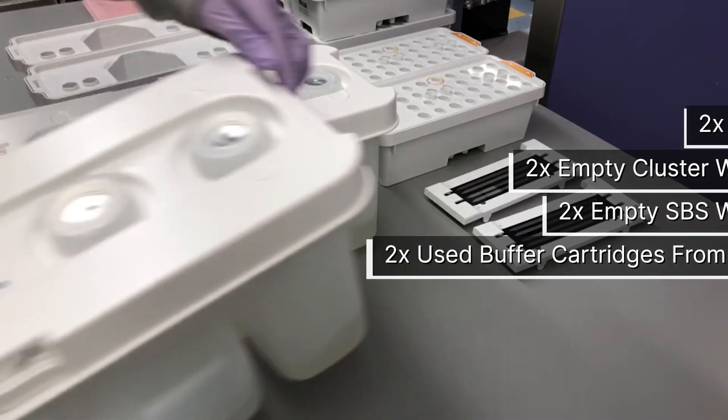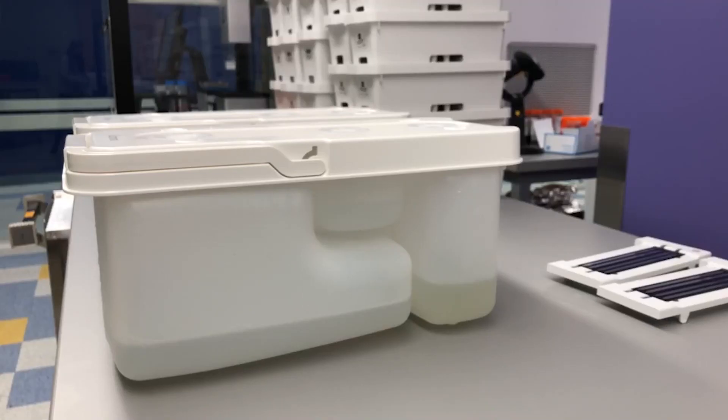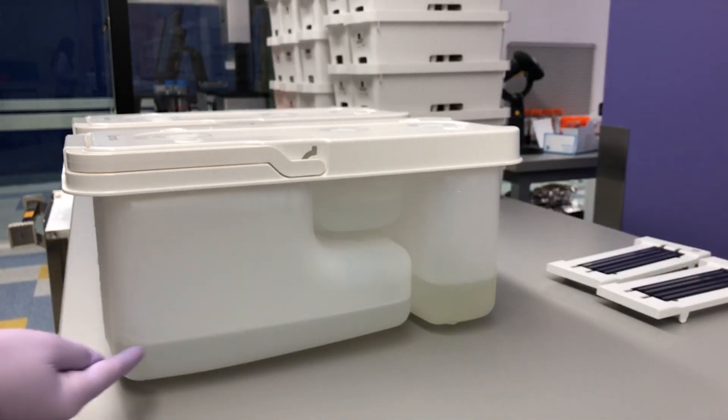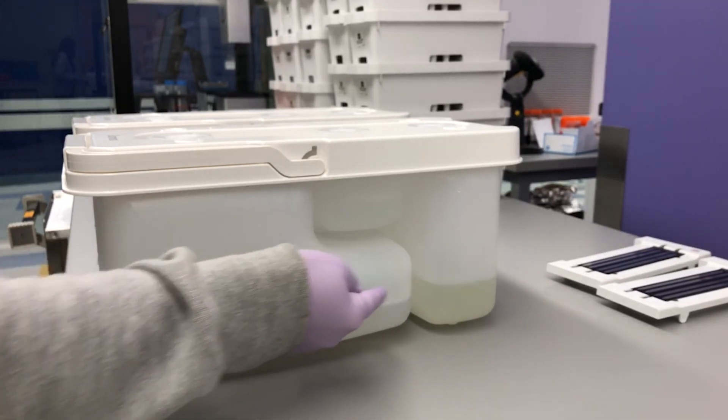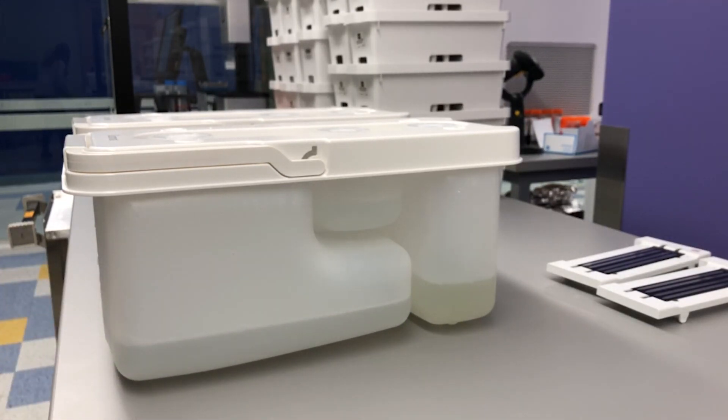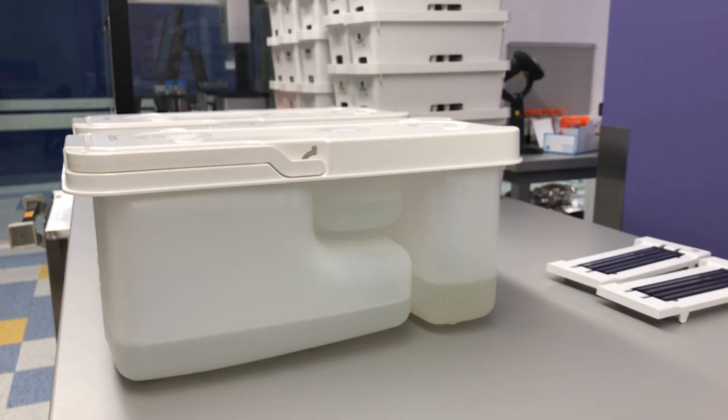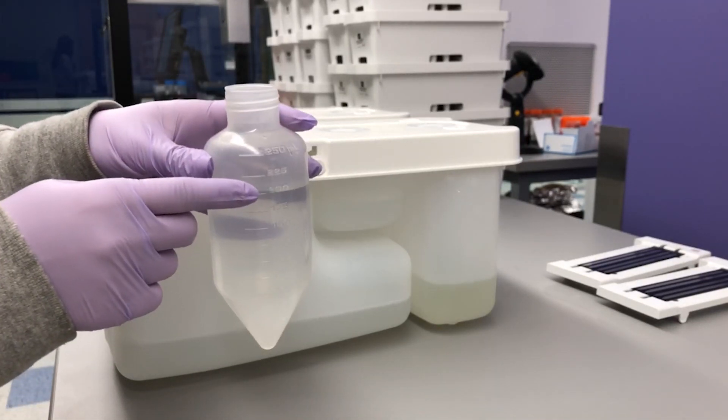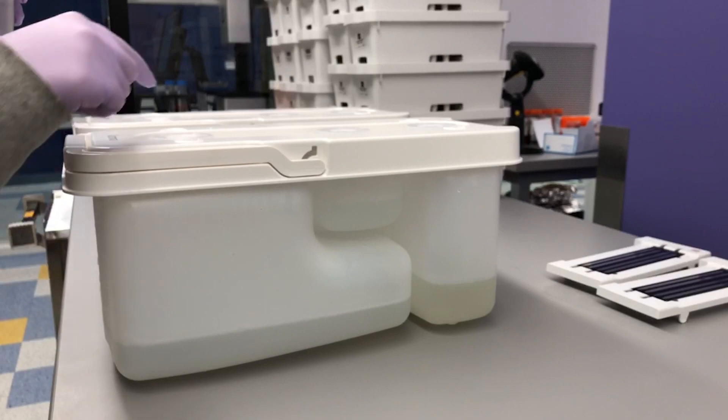Confirm that at least 200 milliliters of BB-3 buffer is present in the VB-2 position of the buffer cartridges. The VB-2 position is the largest compartment of the buffer cartridge. Otherwise, add 200 milliliters of DI water in the large compartment.